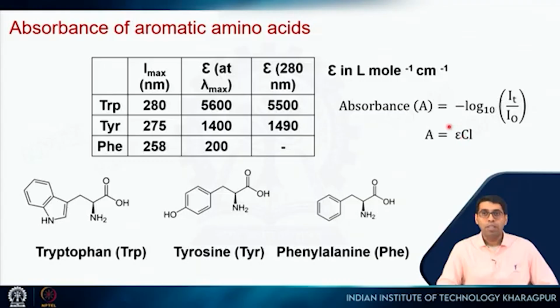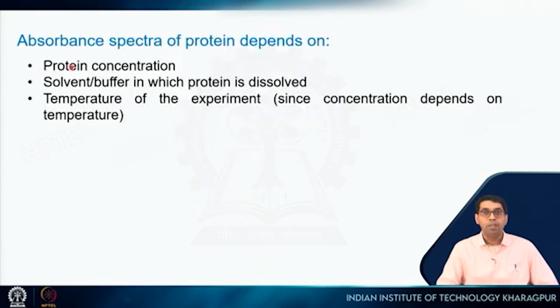So, there are all these different uses for protein concentration. This is one of the basic things that you want to know. Okay. So, absorbance spectra of the protein depends on, of course, the protein concentration.